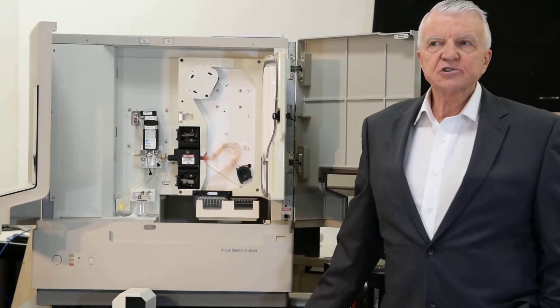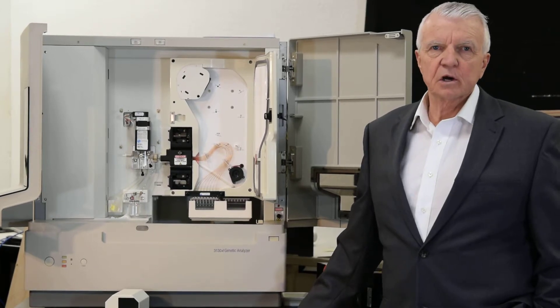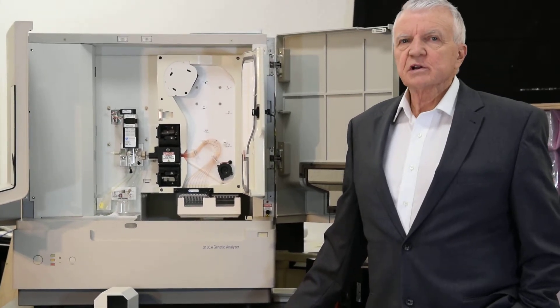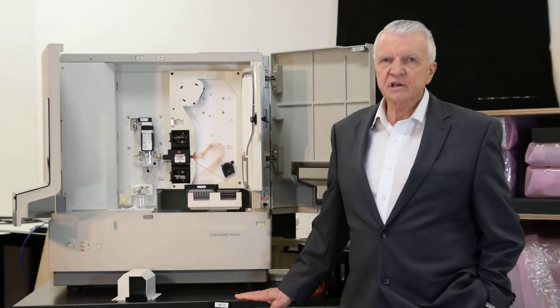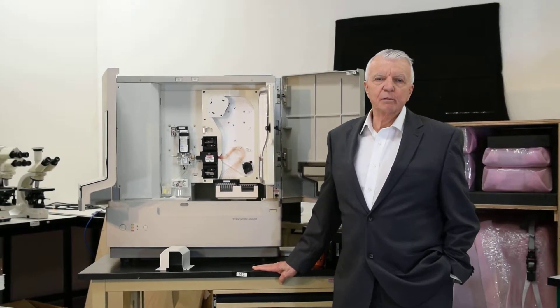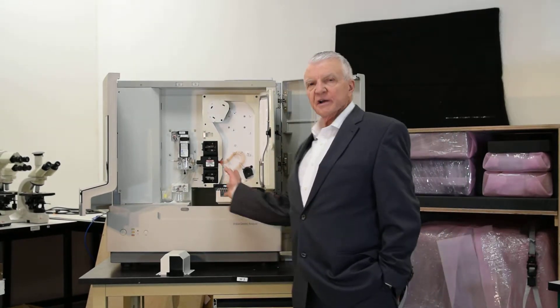The reason for that is you can run a self-test on one of these instruments — you'll see it under the surface tools on even the instrument you may have now. But what it doesn't do is test, for example, the quality of the CCD camera. The CCD camera can pass the self-test, but in fact it will still have problems if it's burning out. So we wet test these.